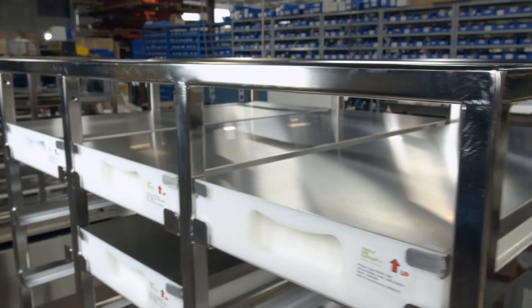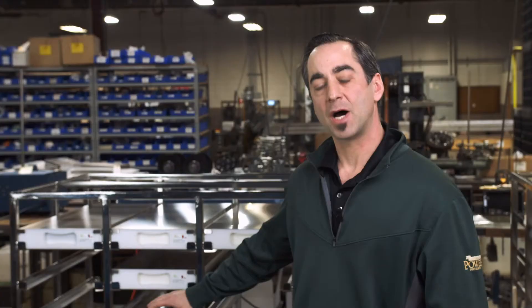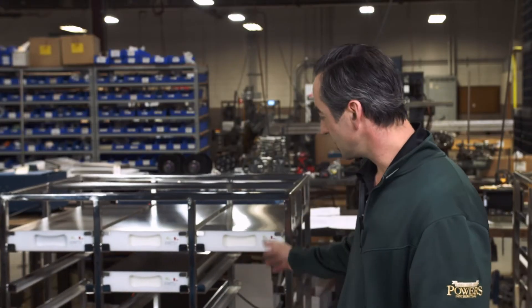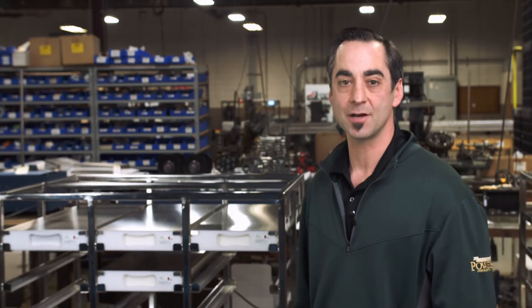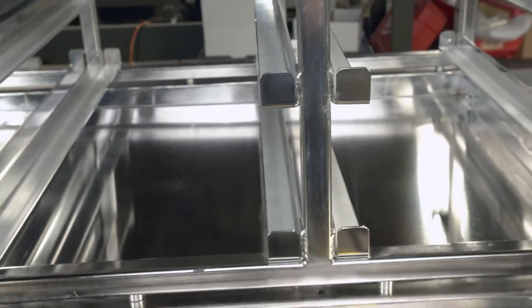Our standard 6155 Series Orbital Shakers are manufactured using powder-coated panels with a cast polymer base. This particular unit right here is a full CGMP suitable stainless steel model. The drip tray at the bottom was designed to collect any condensation.